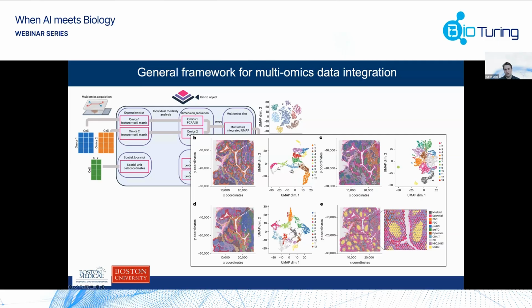But anyway, you can do a single feature analysis, or you can combine the two, and think about how to interpret the results when you have more than one modality. That is something we did here as a quick example, I think with a spatial CITE-seq dataset from 10x, though I don't know exactly what this one is.